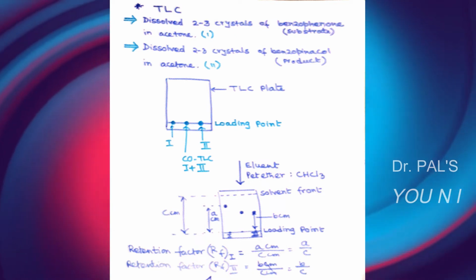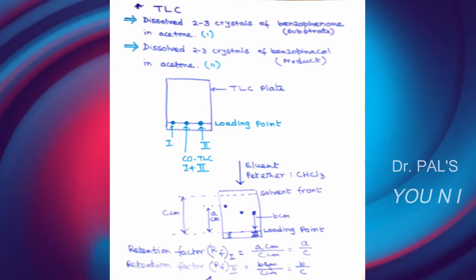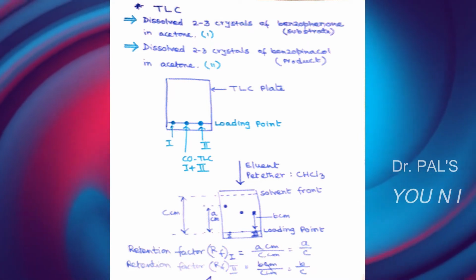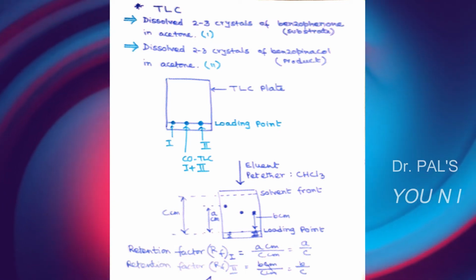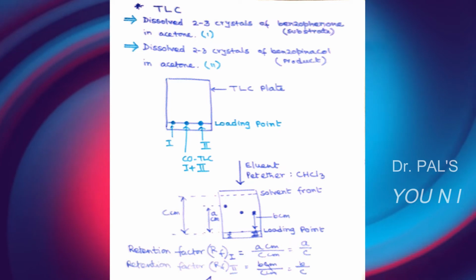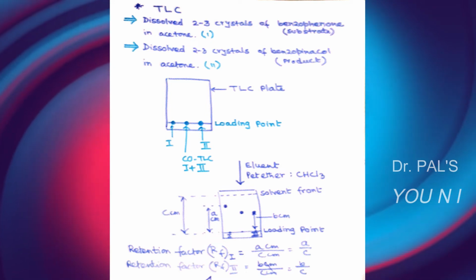Now after 3 or 4 days, or if the sunlight is bright it may take less time, whatever it is, when in the TLC the product spot is pure and does not contain any benzophenone spot, only in that case we have to consider the reaction is over, and then we have to collect the product by filtering the solvent.